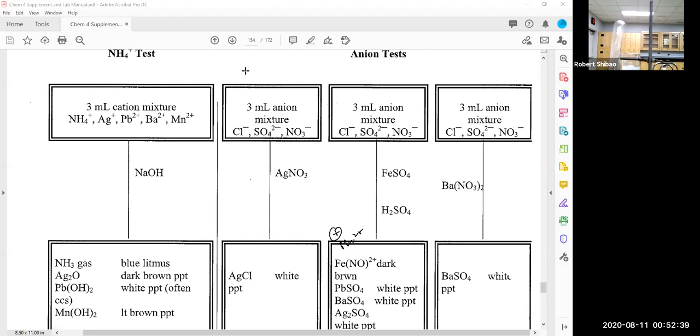Okay, I'm not going to bother getting every little bit. There's a little bit of precipitate left in here, as long as I have enough to test. And if you're looking down here, I have enough to test. There's plenty of white precipitate in there. I can see what's happening. But before I test that, I need to wash it off. Remember, we've got to wash it.